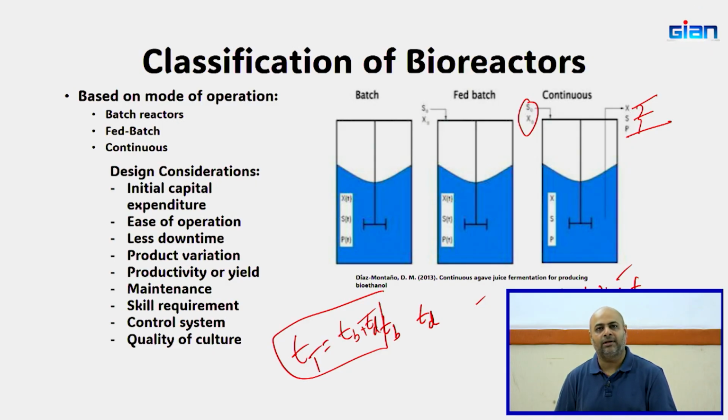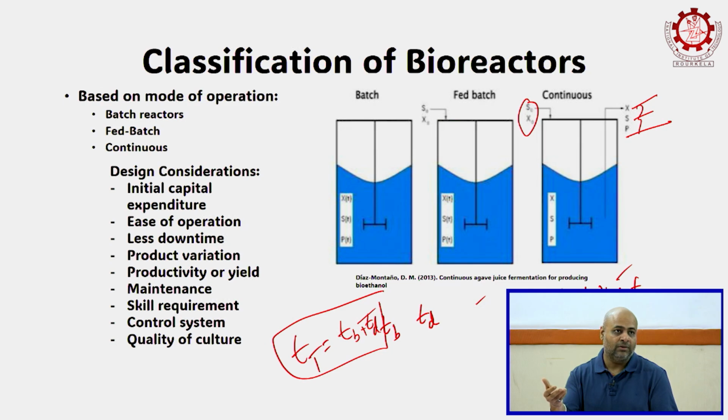You need to understand how the process works, right? Skill is if you can operate it. Technical skill is a different thing. So when you start adding complexities where you have to estimate how much dissolved oxygen is there, and whether you are able to maintain it, you have to do some calculations. Yes, technical skill is required at that time. That might change the type of reactor or the choice of reactor for you, if your choice is to make sure that a specific skill level is employed for a process.